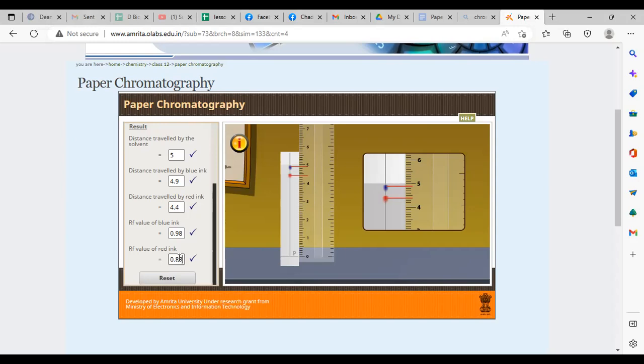So, lalabas yan sa quiz natin. Madali lang. Di-divide nyo lang yung distance traveled by the solute, or kung anong spot na may kulay, divided by the distance traveled by the solvent. Take note, pag di gumalaw yan, 0 yung distance traveled by the spot, so 0 yung RF value mo. Kung kasing bilis lang ng solvent, ang highest value niya will be the distance traveled by the solvent, so 1. Ang range lang na possible value is 1 to 0. Walang pwedeng lumampas. Okay?